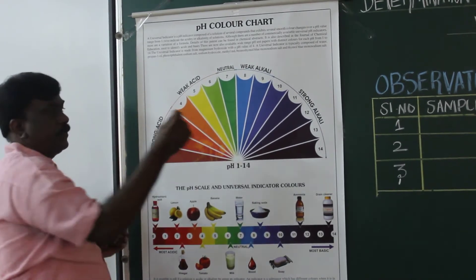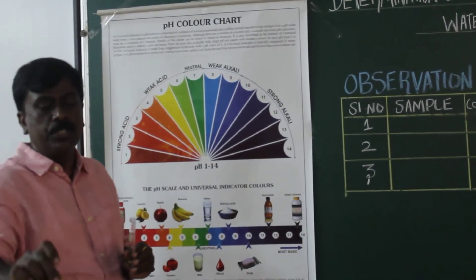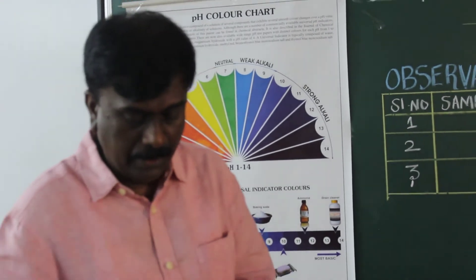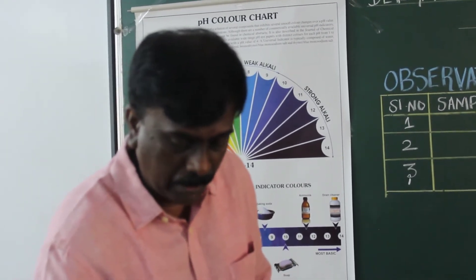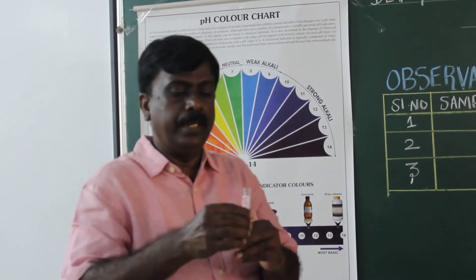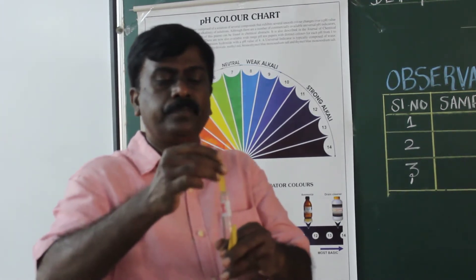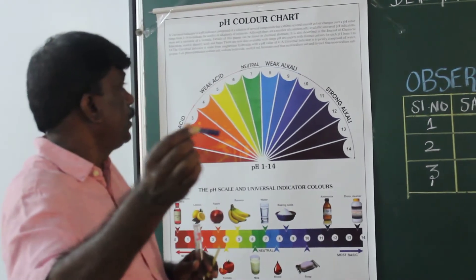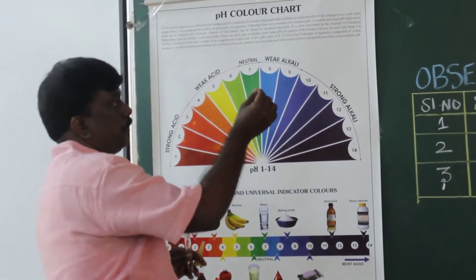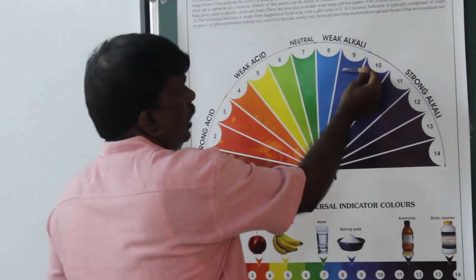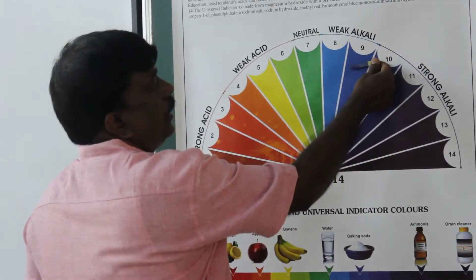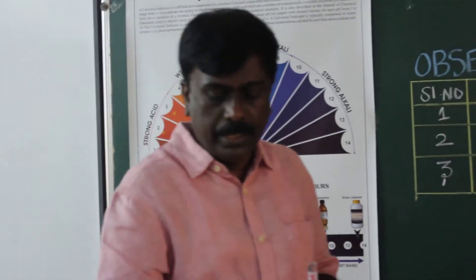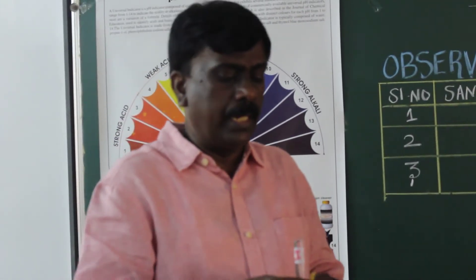From this we are able to identify that the solution from letter 1 is acidic. Then take sample 2 from the test tube, dip the pH paper, and observe the blue color. Compare it with the chart and we get pH 9. That means solution 2 is alkaline.